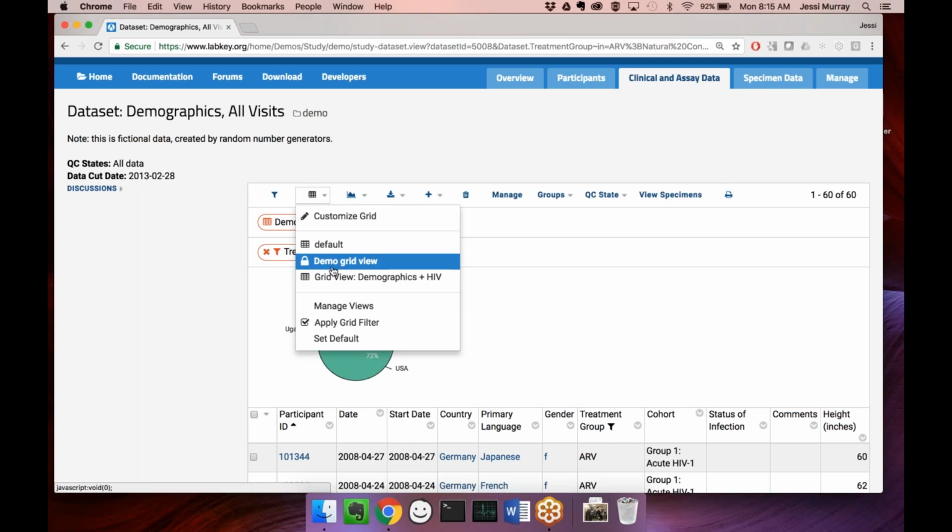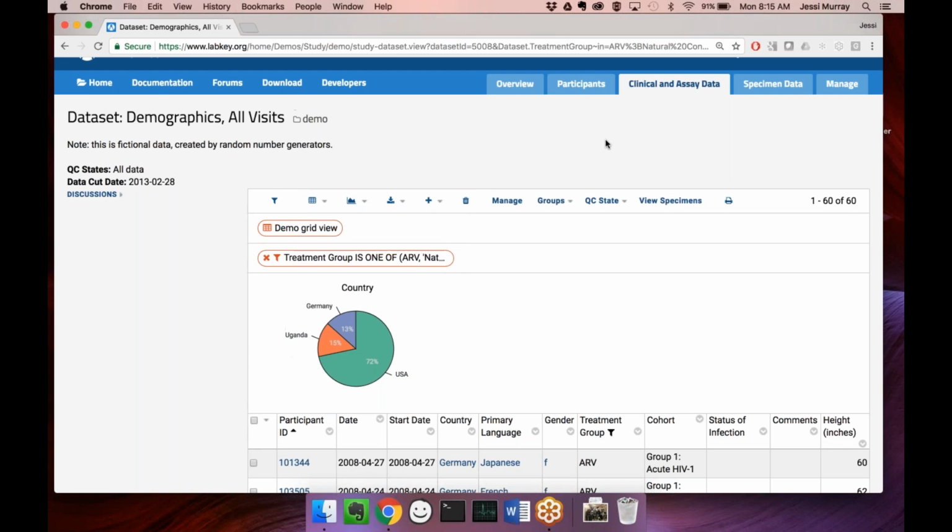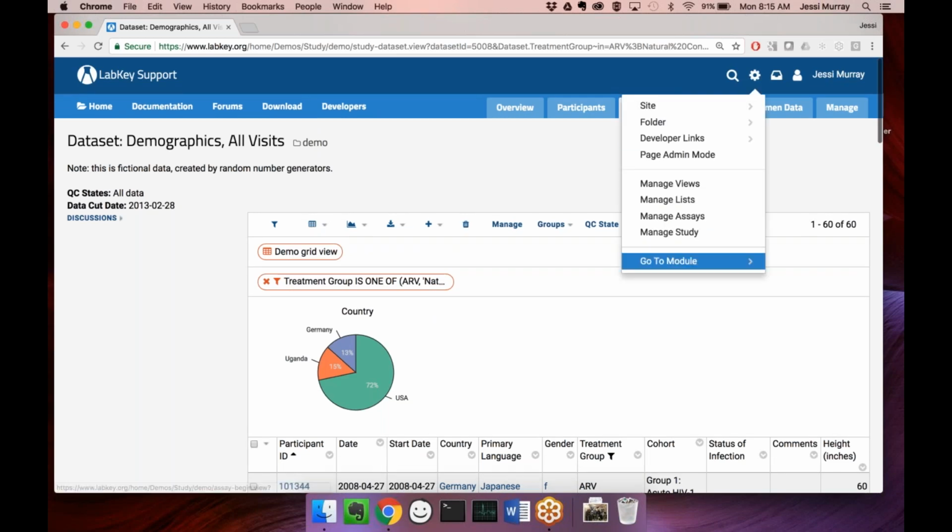We added, there are some of you who have really long lists of custom views in here. I'm not going to go ahead and make, sorry, that is telling me to wake up. I'm not going to go ahead and make 7 more grid views, but if you have 10, you'll get some filtering functionality, which I can show you.